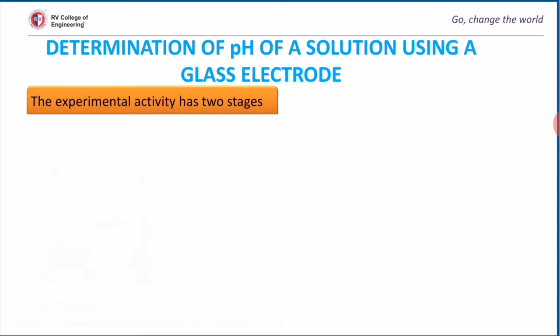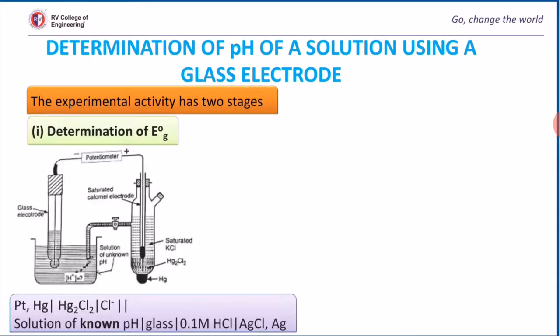Now we will measure the pH of unknown solution using glass electrode with this setup. This experimental setup has two stages. In the first step, we will determine the E naught value. In the second step, we will determine the EG value.